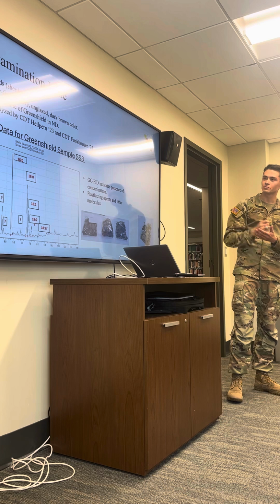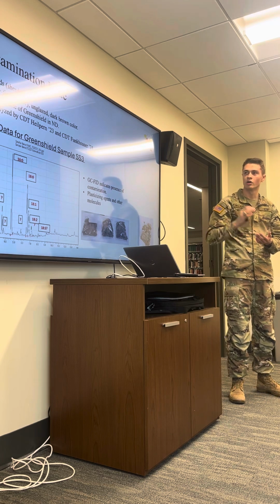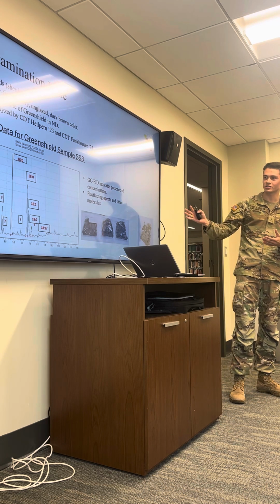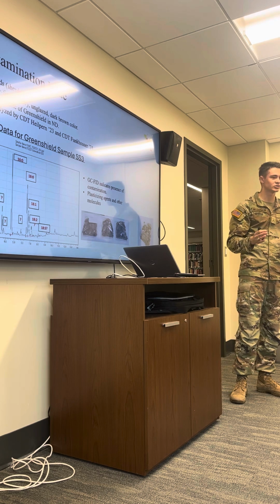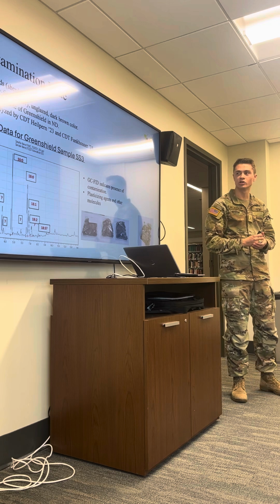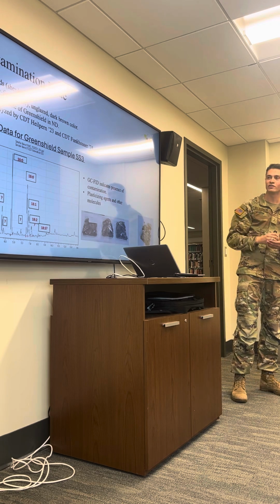And so first begins with the contamination issue. Whenever first potsherds or just sherds were analyzed, which are just low-fired pottery, which are unglazed and dark brown in color, as you can see below. These came from the Archaeological site of Green Shield in North Dakota, analyzed by previous cadets.